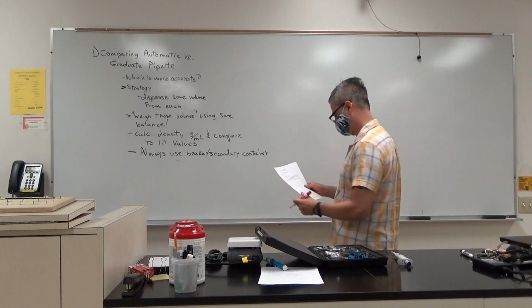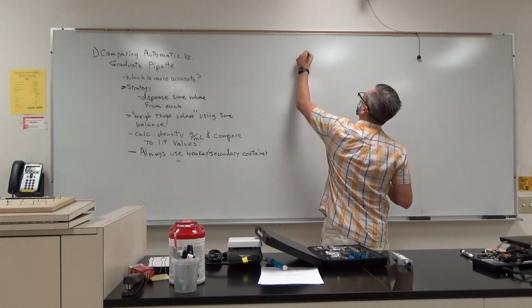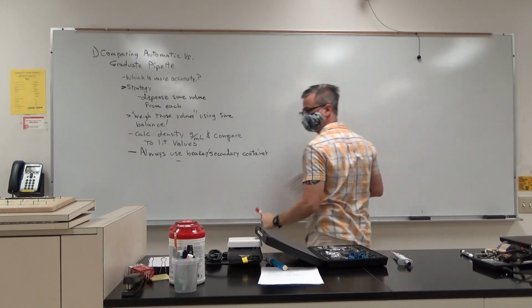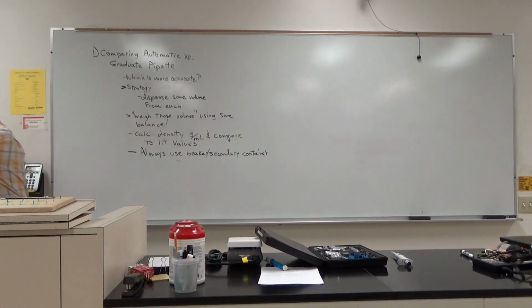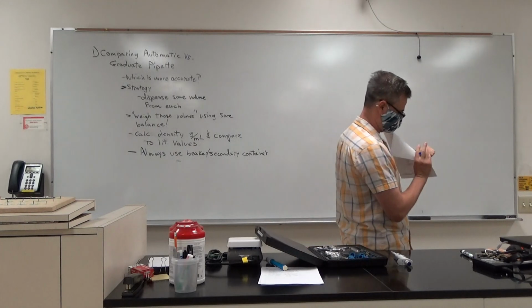This is how I would recommend you do it. You've got both your 3 ml conical vial and your 5 ml.